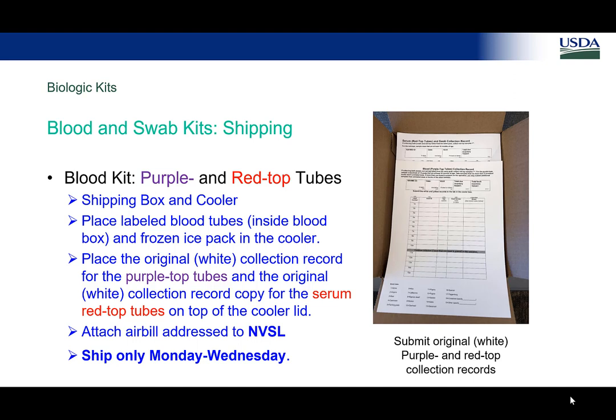So we're gonna put, I think there are three ice packs in this kit, so we're gonna put two ice packs with the swab samples, because I don't know if this insulated mailer is as great as I think it's gonna be. It's an experiment. So we're gonna put this in, absorbent sheets. We have two, because there's two samples. Yeah, we'll do two.